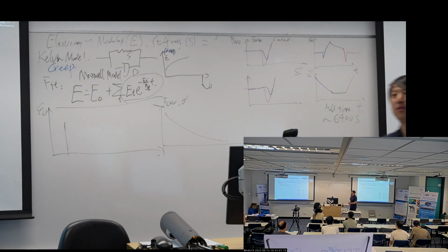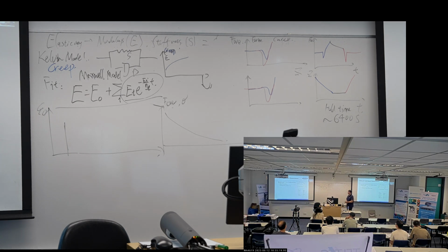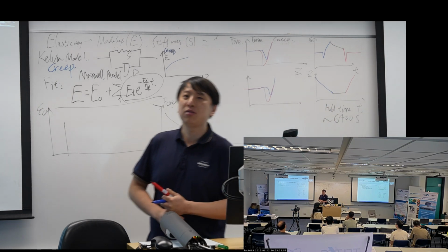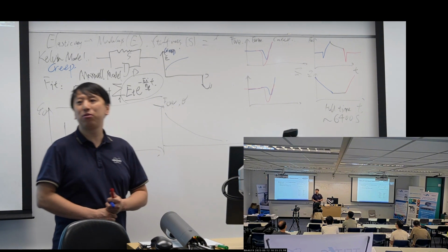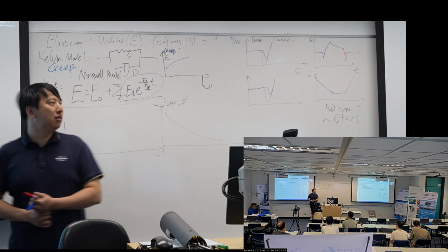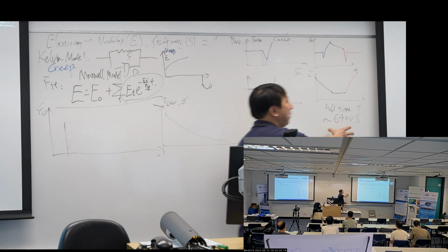So actually, that's quite a long time. Usually, people will just hold maybe several minutes. That's the maximum. Mostly they would do less than 1 second, and maybe some biological guys can hold it up to maybe several minutes, but this instrument provides about 2 hours.